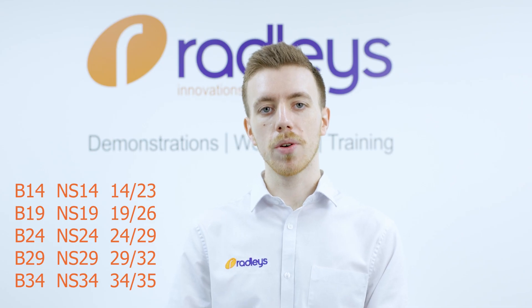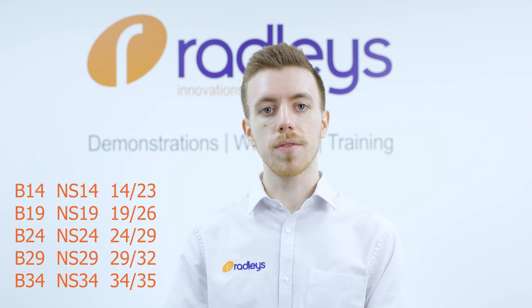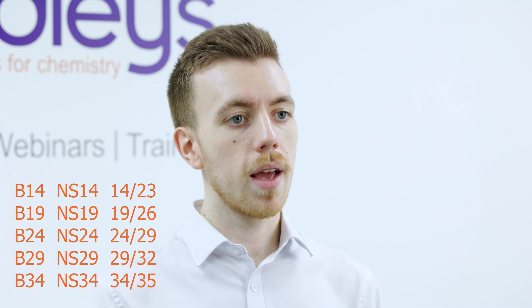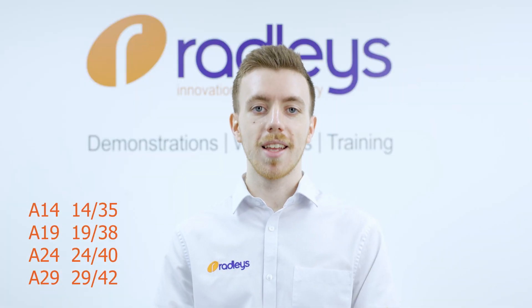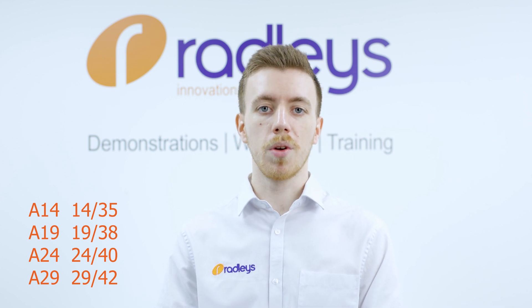You may also have seen joint sizes written as B24 or A24. These represent standardized lengths for each joint width. B joints are the standard joint size in the UK and many other countries. American standard joints are longer but still compatible with B joints. These are sometimes abbreviated as A19, A14, and so on.